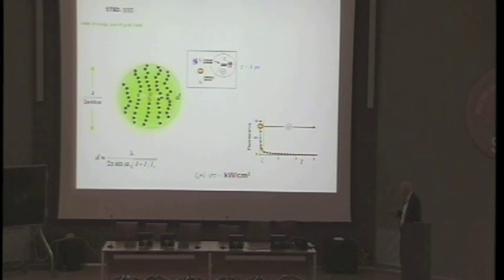It means the intensity requirement to shut it off or to get it from one state to the other is reduced by orders of magnitude. By 3 orders of magnitude. Nanosecond, microsecond, 3 orders of magnitude. Again, you flood everything with light, but only this one is allowed to emit. This is dark, and this is how you separate it.